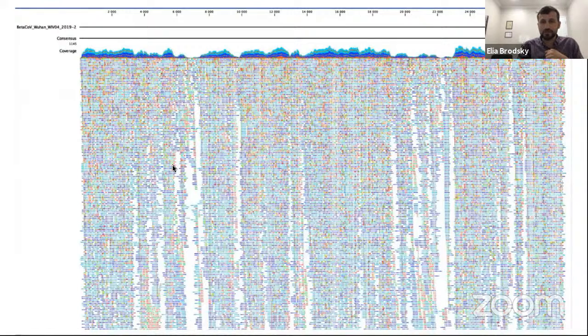You have all of these reads, and these reads are aligned to some reference. Now, that does not mean that these reads came specifically from this virus. You just take a sample and you're saying, okay, let me align it to this specific type of reference. You will also have a consensus. A consensus talks about the majority of the nucleotides from the aligned reads, and they could be very different from the reference that we are using for alignment. We're just using this alignment to give it a framework to follow.